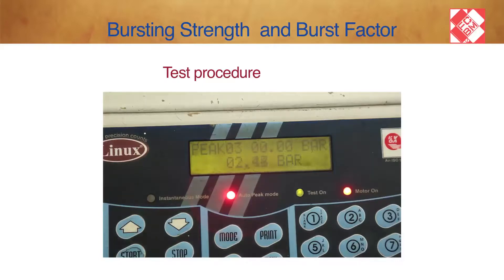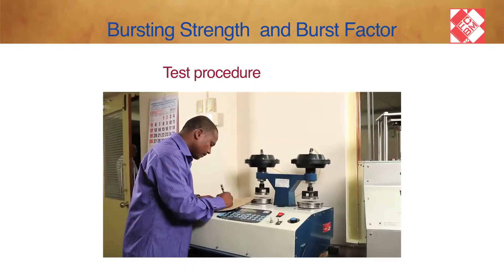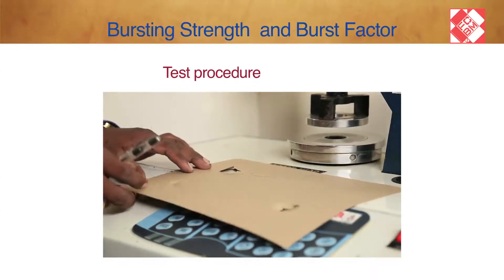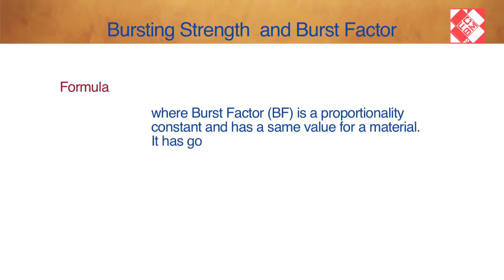Push the button upward and remove the old sample. The instrument is ready for the next test. Once the bursting strength is calculated, the burst factor can easily be calculated using the given expression: Burst Factor equals bursting strength multiplied by 1000, divided by grammage. The burst factor (BF) is a proportionality constant with the same value for a material and has no units.